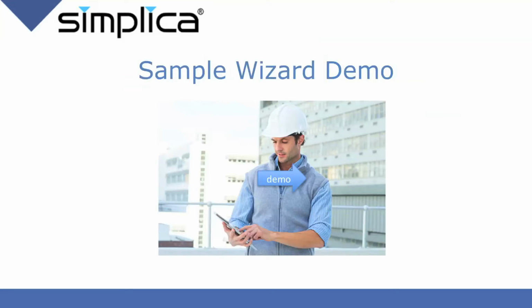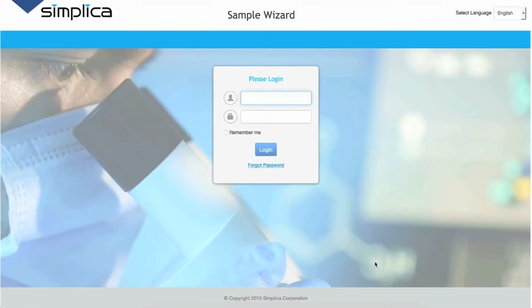Let's take a look at the Sample Wizard itself. Okay, we start by logging in.